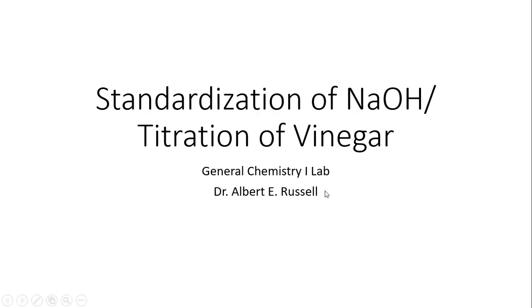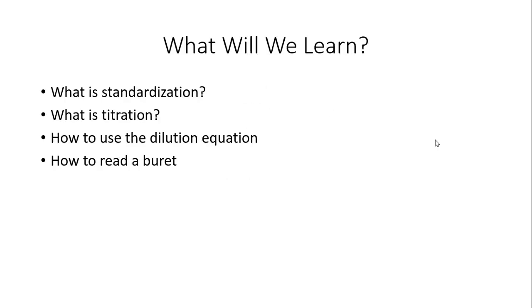We're going to talk about now the standardization of sodium hydroxide using KHP, and we're also going to use that standardized sodium hydroxide to titrate vinegar. So let's jump right in. What are we going to learn? We're going to learn what standardization is. We're going to learn what titration is, how to use the dilution equation, and how to read a burette.